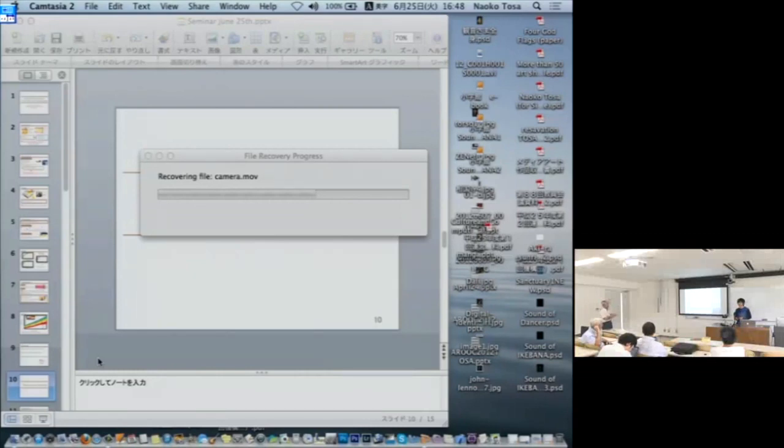I hear Kusafuka-san measured onion epidermal tissue by drying it one night in a 40-degree oven. Yes. So I need to find a suitable condition for drying.